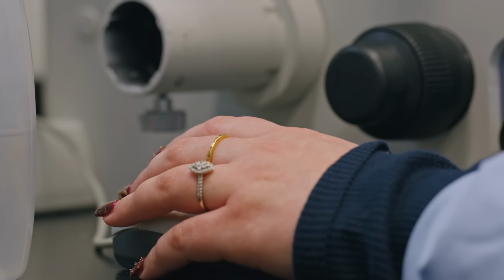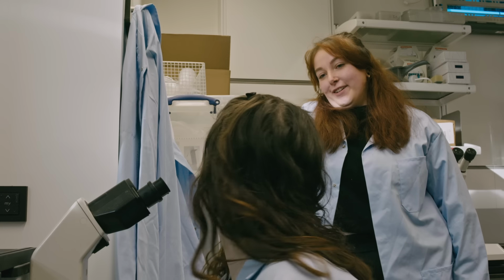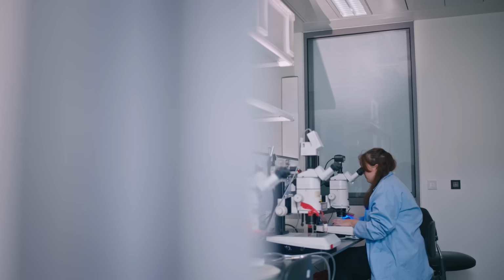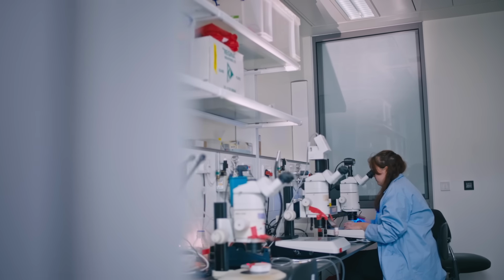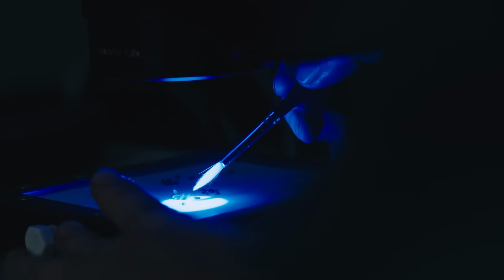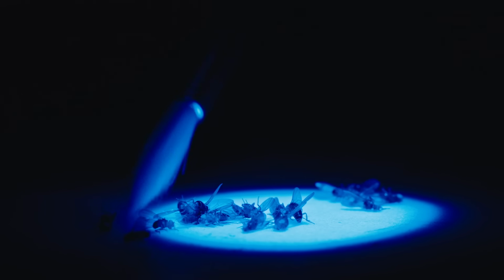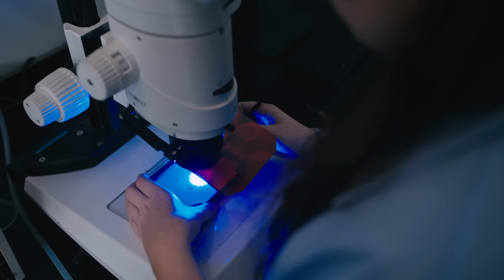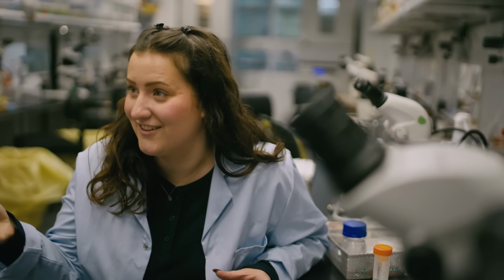What was told to me was that if you can play video games, you can inject a fly because of the controls. Wow. Okay, let me explain what's going on here. Hannah isn't changing fly DNA to make them less annoying. The purpose of this task is to add unique genetic markers to groups of flies according to what research scientists want to study. That means creating a new strain of fly by altering something specific in their genes linked to the research.